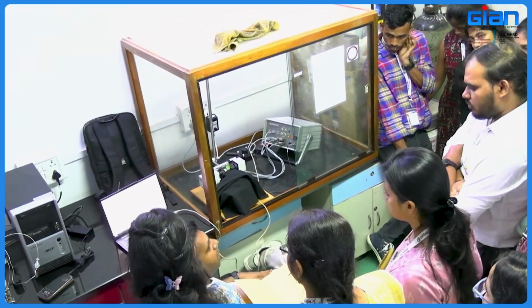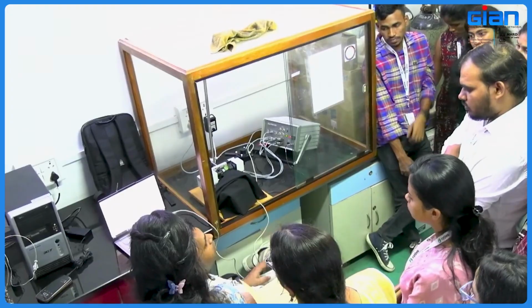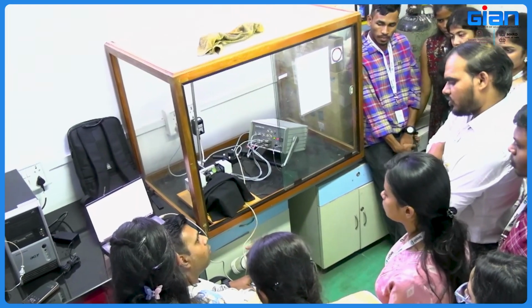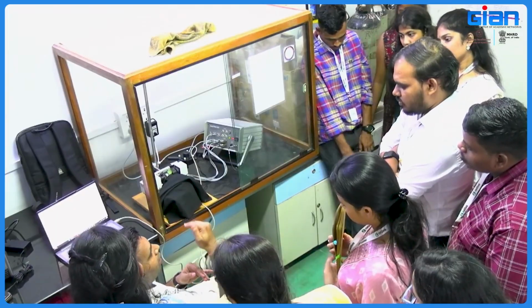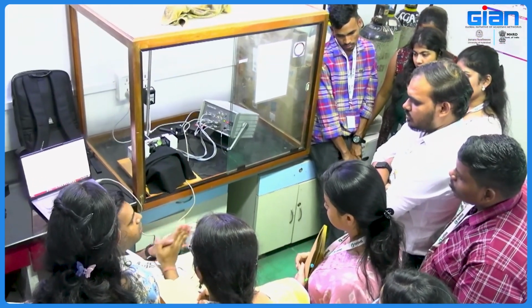If the yield is dropping, then there is some change, and if YNO is increasing... usually YNPQ and YNO are inversely proportional. If YNPQ increases, YNO drops. If YNO increases, YNPQ drops. If a plant is having a higher YNO and a lower YNPQ and the yield is low, so is the plant under stress or not?